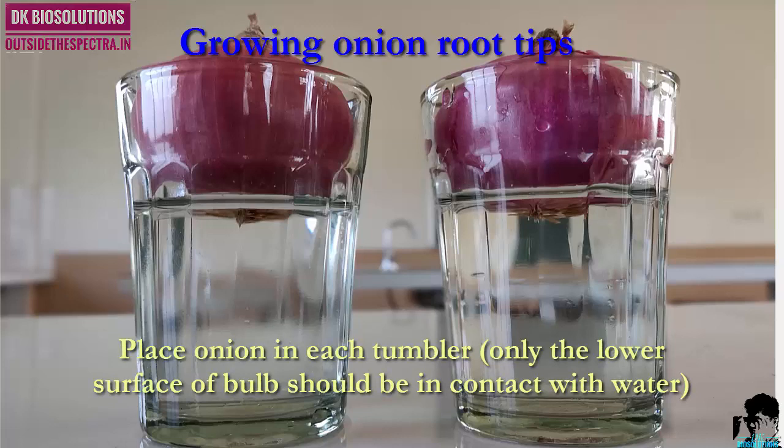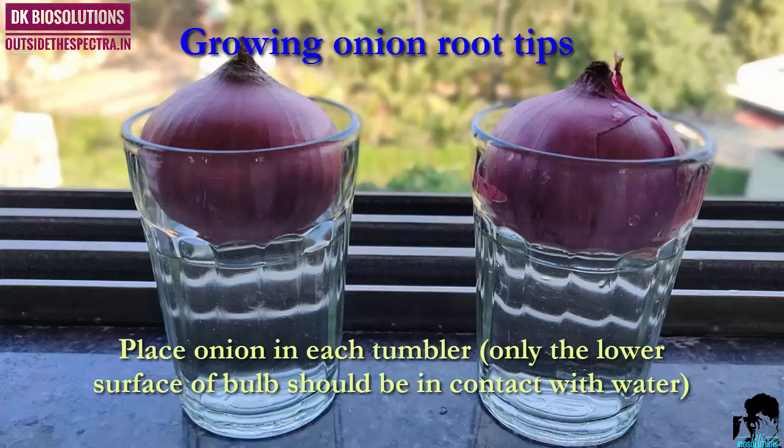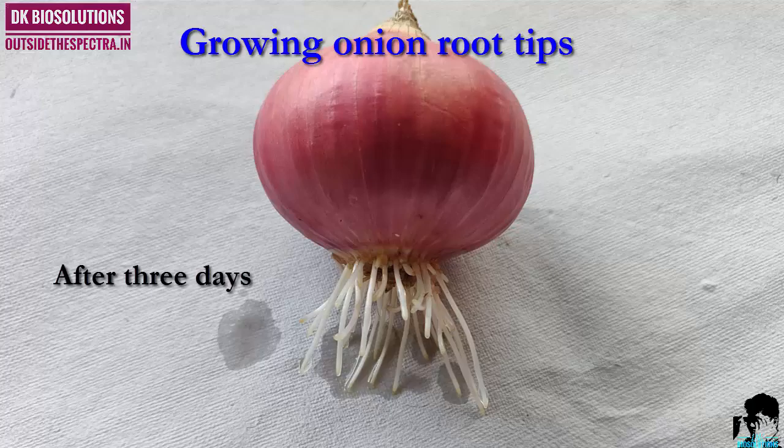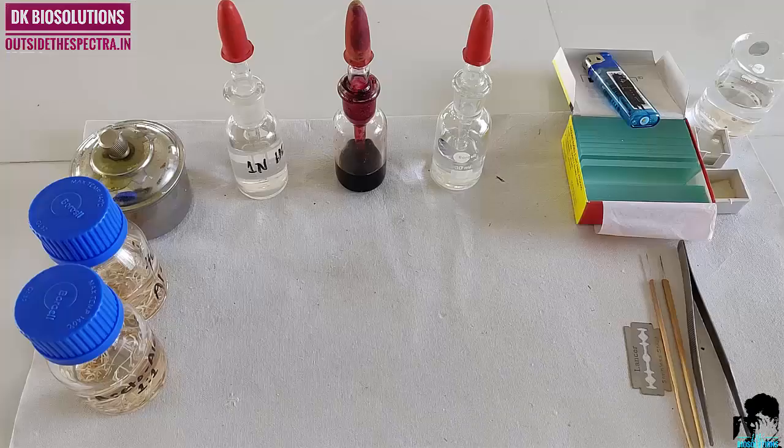While placing onions in tumblers, take care that only the lower surface of the bulb should be in contact with water. After three to four days, you will get healthy roots.